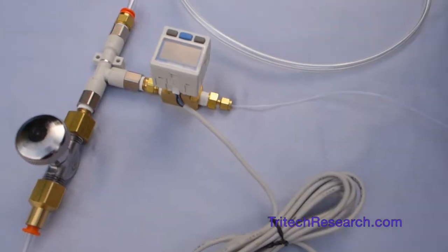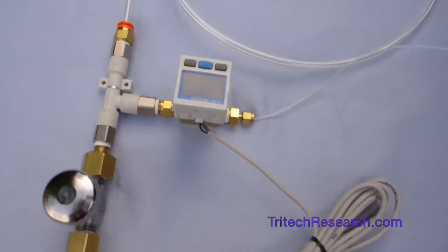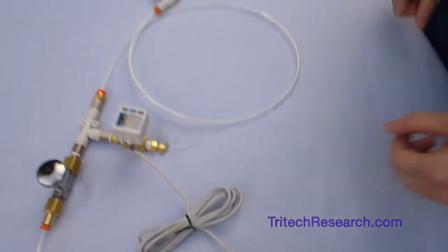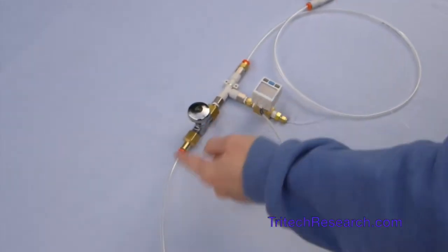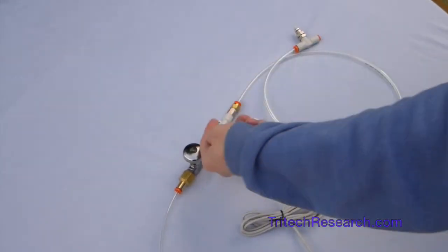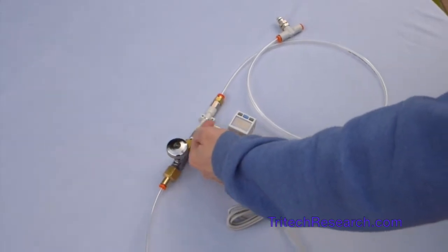And this is a digital pressure gauge which we'll show later in operation that shows you actually what the pressure is on the output. So the principle here is by Bernoulli's principle: as gas flows through in this direction it creates a negative pressure here.